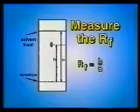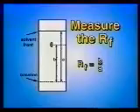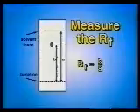In the final step, the relationship between the distance moved by the compound spot and the distance moved by the eluting solvent is recorded. This measurement, the retardation or retention factor of the specific compound, is most commonly referred to as its RF.